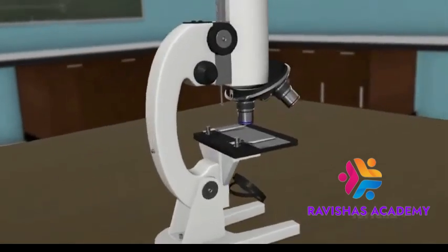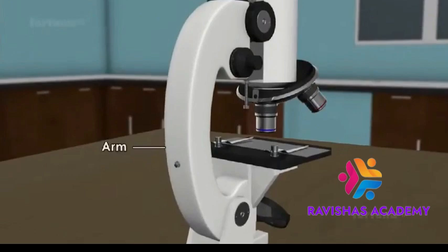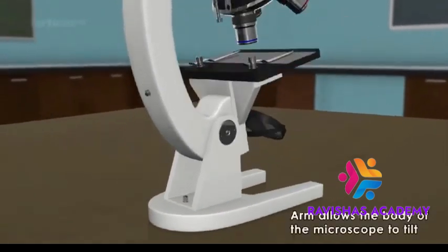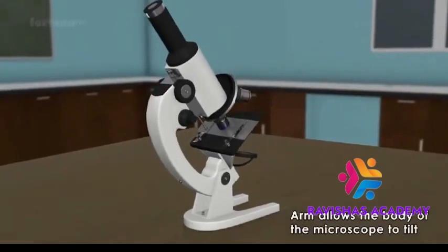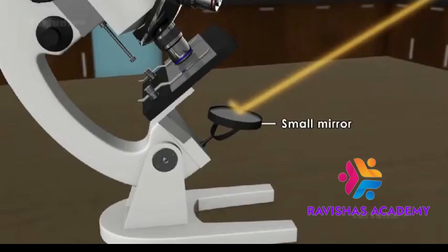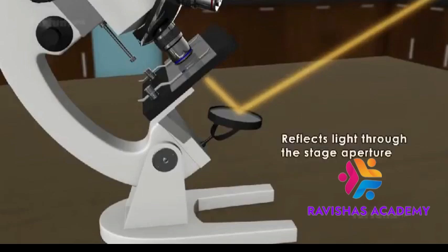The body tube is arranged on an arm which is connected to a strong base. This arm allows the body of the microscope to tilt. A small mirror at the base of the microscope reflects the light through the stage aperture.